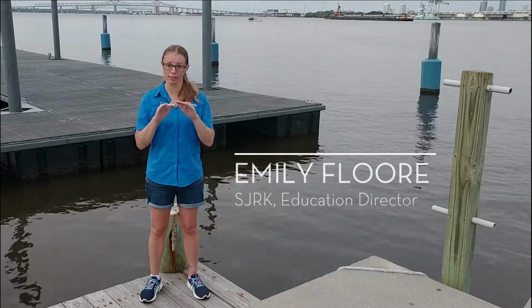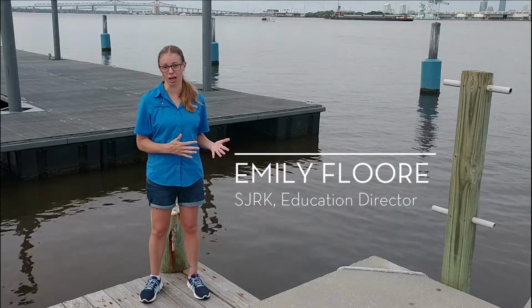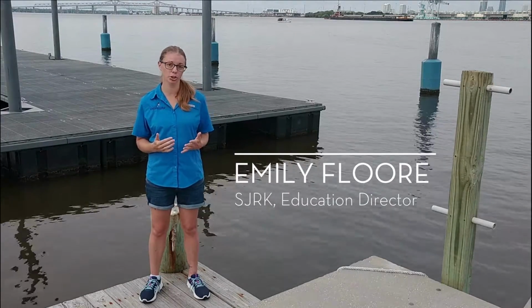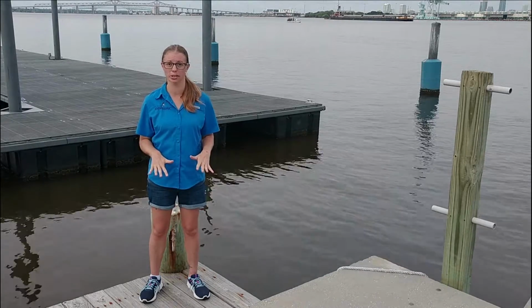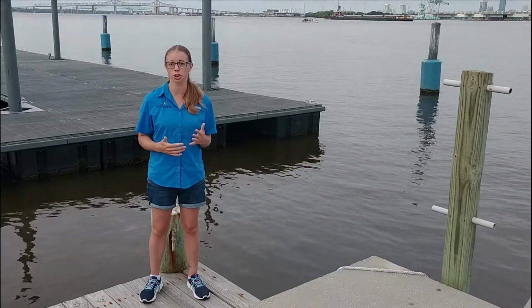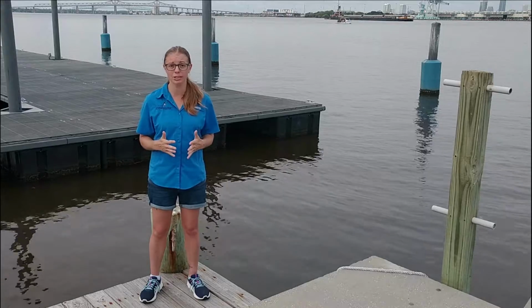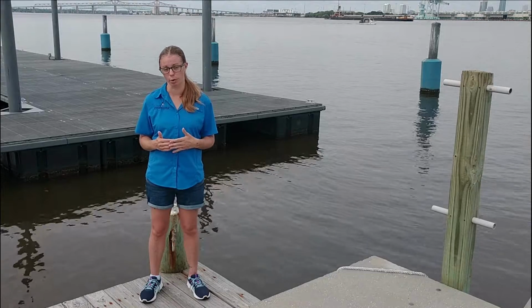quality of our St. Johns River at the surface and at the bottom, right off of Jacksonville University's docks. Every water body has a vertical water column, which differs in physical, chemical, and biological characteristics, and it extends from the water surface all the way down to the bottom. Now, not every water body is uniform. There are valleys and peaks, channels and shoals. So the results we find today are not going to be the same if we were to do this same water quality testing, even just a few feet off of the dock from where we're sampling.